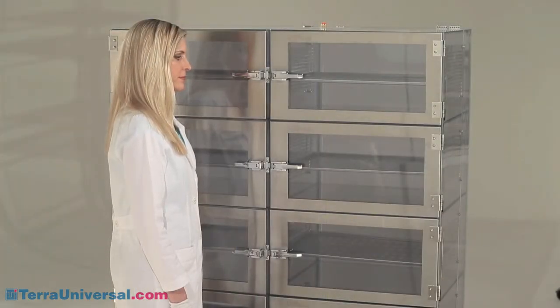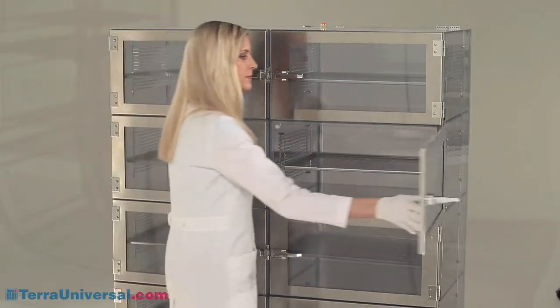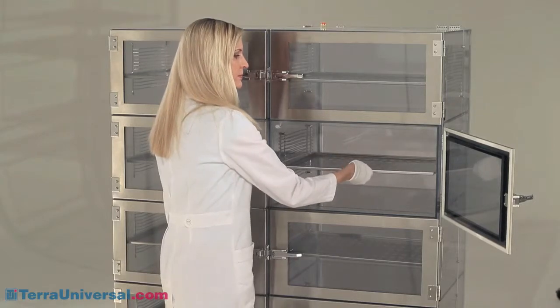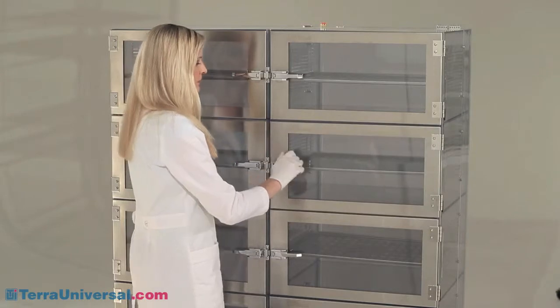All of Terra's Adjust-A-Shelf desiccators feature electro-polished 304 stainless steel racks, which allow shelf placement at various positions. Choose between electro-polished stainless steel shelves or trays, or reinforced plastic shelves.